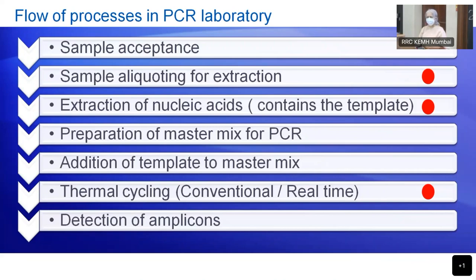Then of course it undergoes thermal cycling. If you use real-time PCR, you don't have to handle the amplicon. But after conventional PCR, you know there is a plate, and PCR has happened on the reagents in that plate. It's usually covered, right? What happens when you remove the cover? Aerosols will happen, right? So you need to be extremely careful and do it slowly so that aerosolization is minimized. Aerosolization can never be reduced to zero, but at least your actions should be such that you minimize it.